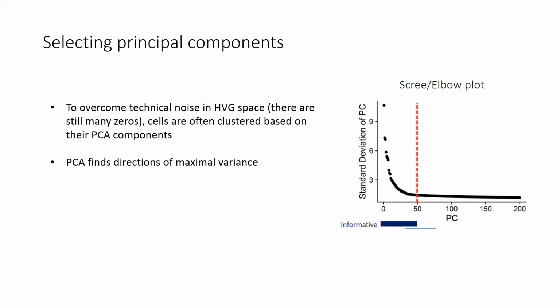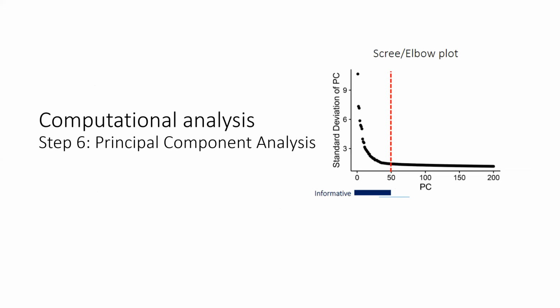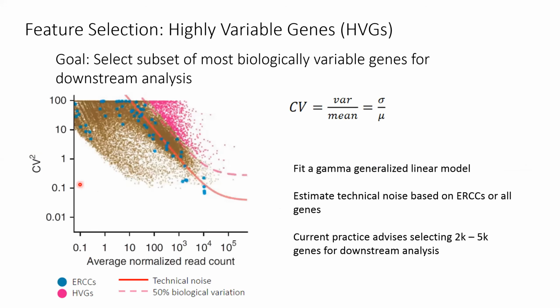So we're modeling how the coefficient of variation depends on the mean. So there's some expectations that the mean variance relationship is constant, which might not be right, but it's mostly looking for which genes have the highest variance depending on their mean. So the dependent variable is the coefficient of variation, and then the gene itself is the independent variable in that equation?